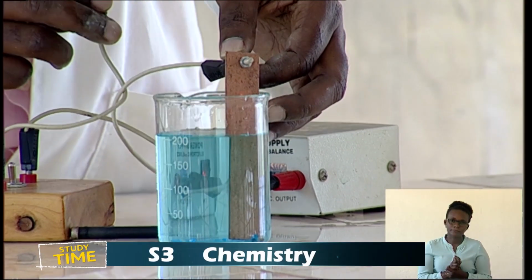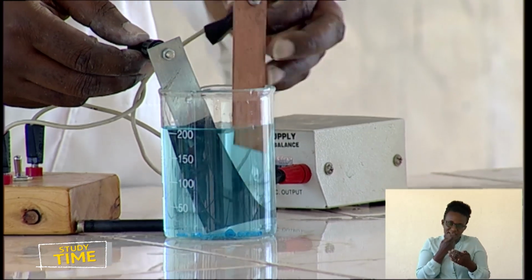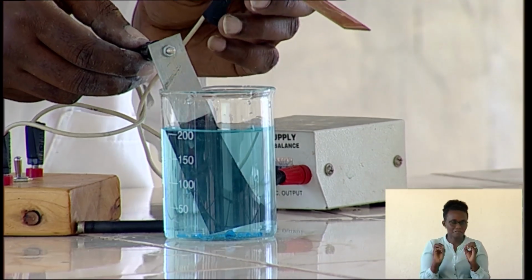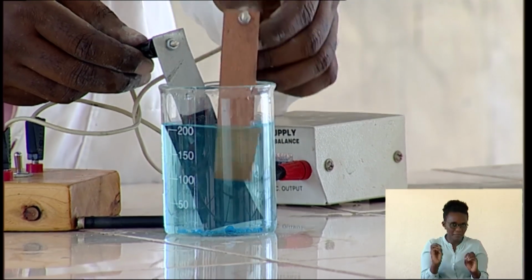Is this one still white? No. What about this? Do you see anything happening? You may think there is nothing that is happening.